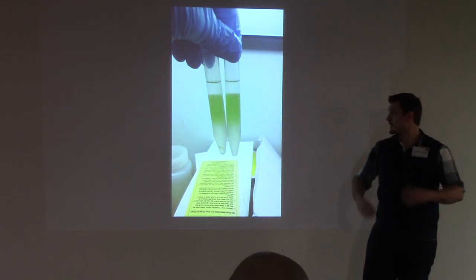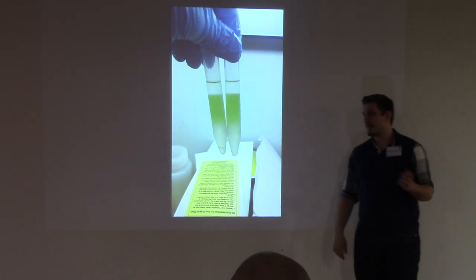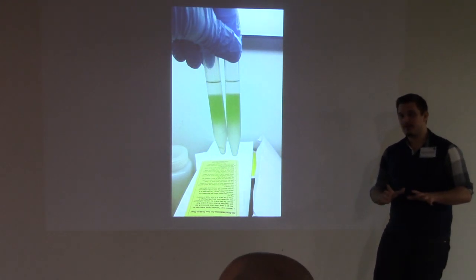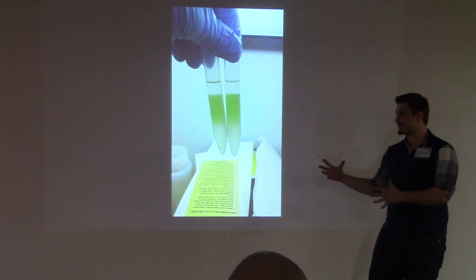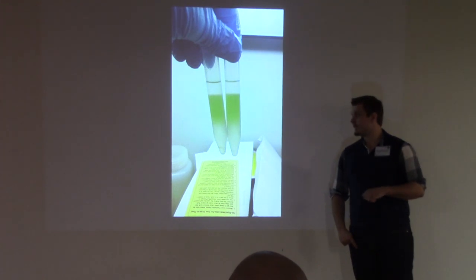that you can actually utilize. Now, I've used like 7 different centrifuges across a bunch of hackerspaces, and I found that this one old hand crank centrifuge is the best. Because you can't get a swing out with really low RPM if you purchase a swing out centrifuge. They start at like 300 RPM. So what I did is I bought a hand crank centrifuge.